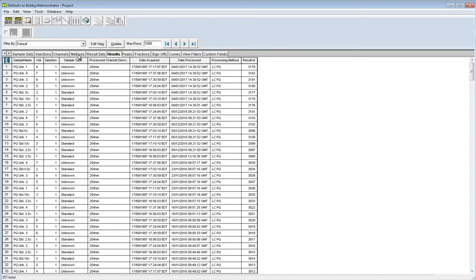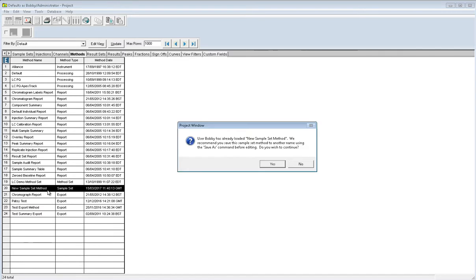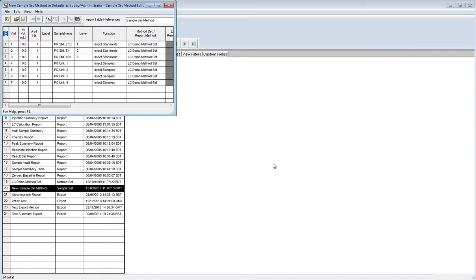A new sample set method is created in mPower based on the sample information that was exported. This can then be used to perform data analysis on your samples.